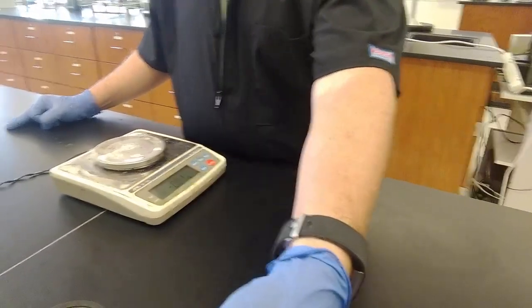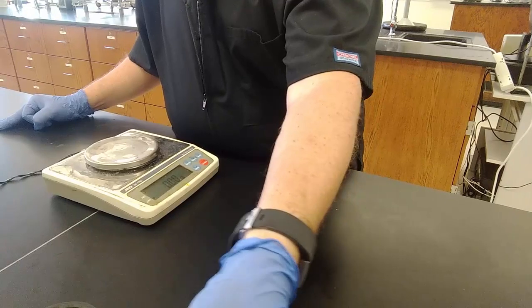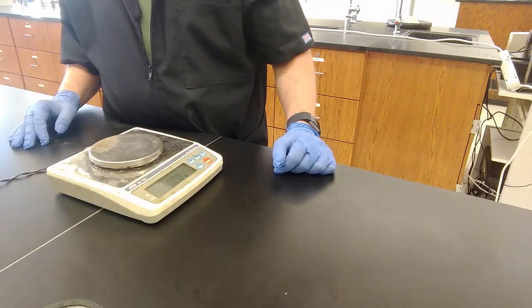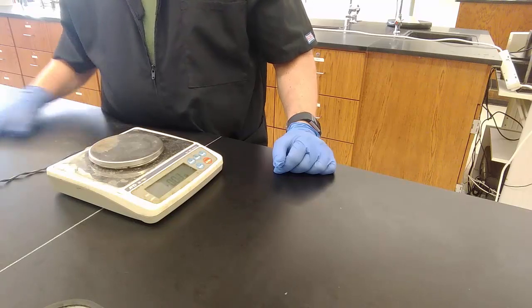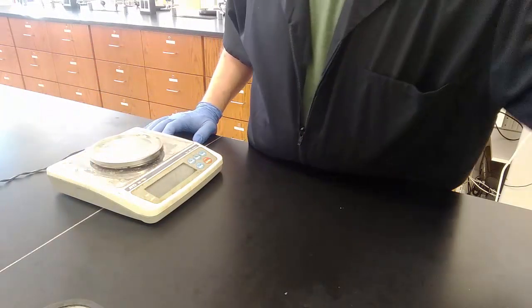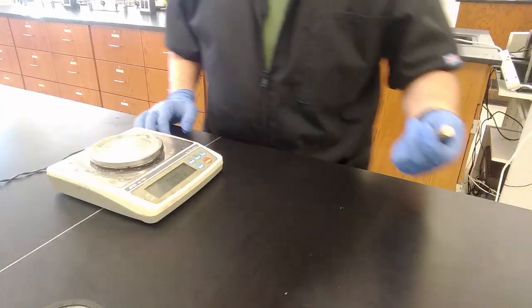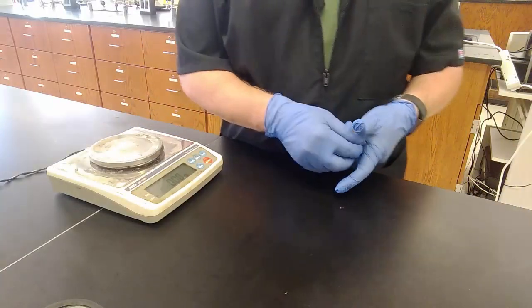So I have a balance here that I will use after I do step 1, which is obtain a metal bar, record its color on the data sheet in pen, not in pencil. So why might you want to record your data in pen and not pencil?